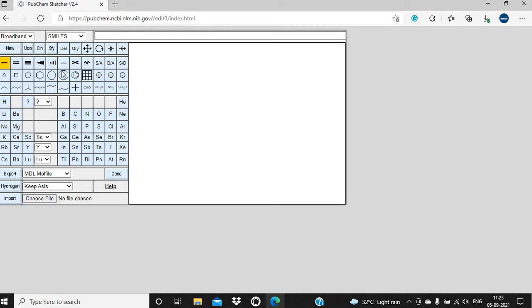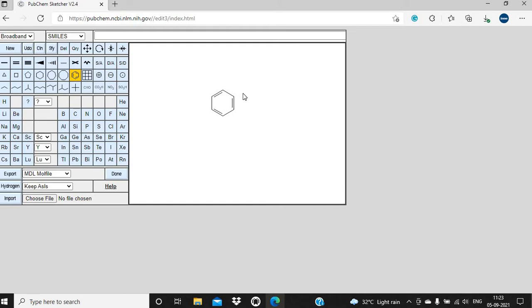Here are different options which will assist in drawing chemical structures, and this is the drawing area where we will draw the structure. So if you want to draw a benzene ring, then you have to simply click here on the benzene ring and then place the cursor in the drawing area and simply click. So you will get the benzene ring.